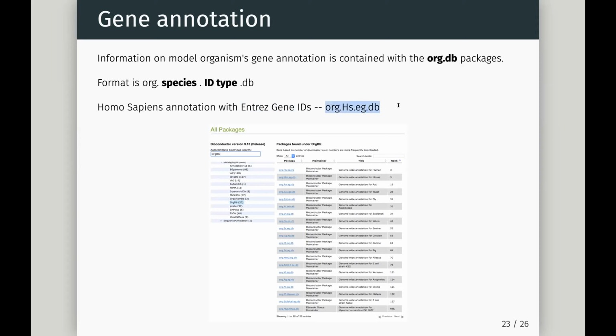And we don't need to have a different version of this for every genome build, because this is just the mapping of gene names, right? Genes to functions. So this isn't changing in combination with the genome builds, GRCh37, GRCh38.